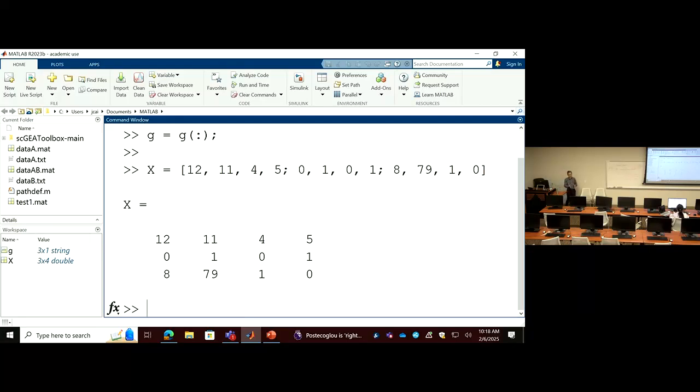This is not real data, but I follow some kind of rule based on my experience, my understanding of the data itself. It could be a big real data set and the corner of it looks like that. All right.